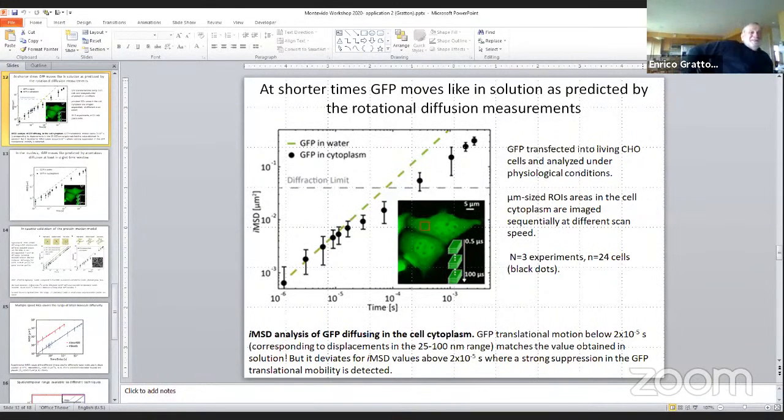No, okay. We haven't finished the work. There's still a lot of things to be done. Yeah, exactly. Well, I'm coming up with the experiments that I would love to do. Okay. Of course, the famous structures in the membrane are supposed to be very, very small and very, very fast. And this is a limit in some way. We can go maybe another factor of 10. But we cannot go much lower simply because you don't get very many photons. But you can go, in terms of size, another factor of 10. And that's in speed, a factor of 10.